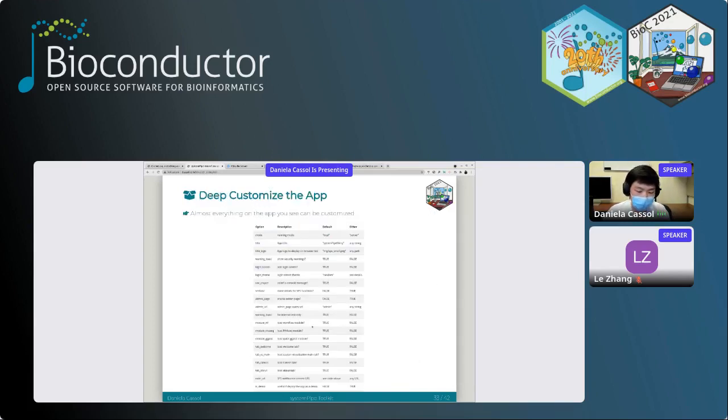And then as a framework, SPS allows you to configure a lot of things. You can see there's a list of all the options you can have. That means you can change almost everything you see on the dashboard. Anything you don't want, like if you don't want some modules, you can just disable those modules, override them with your own modules, or load your new custom things.